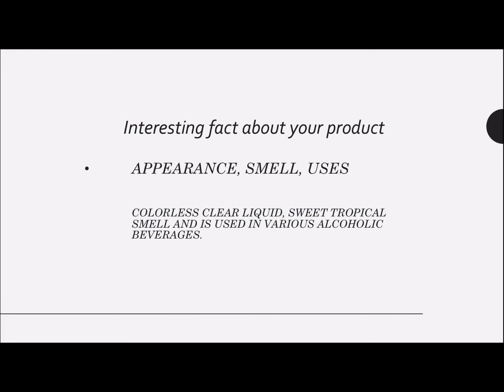An interesting fact about our product while we're going through it is the appearance of it all, being a clear liquid. We're actually able to know the smell of our ester, and it's used as a flavor ingredient, and it's found in apples and grapes. The properties it has allow it to be used in various alcoholic beverages, and it has more of a tropical, fruity scent to it.